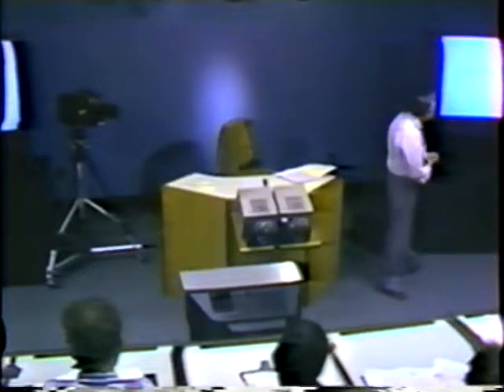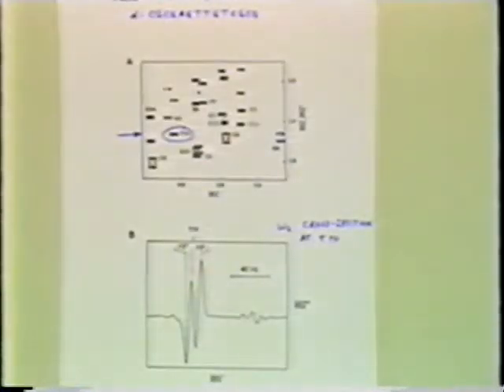Therefore, it's dangerous to look at one cross-section. One should look at a contour plot. Otherwise, you may start thinking that at this place we have a cross peak here, which is not true.